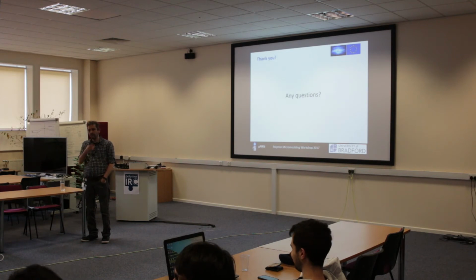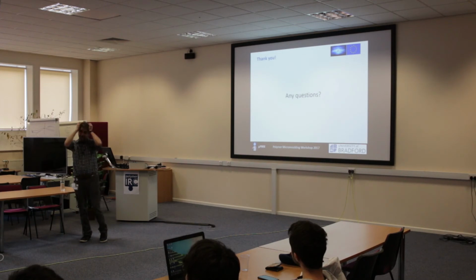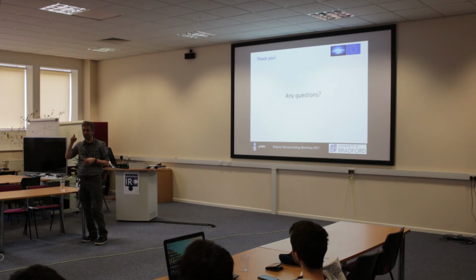So we're doing work with PLA upstairs for a company, but that has 4 different additional polymers in. And I didn't want to put a DSC trace with all of these things in. I'll show you later, all right? But it's truly horrible. I've got the student pulling out his hair, the whole thing. He thought it was complicated enough with 3. We've now moved to a 4 material mix, and the DSCs are just horrible. Some cold crystallize as well.